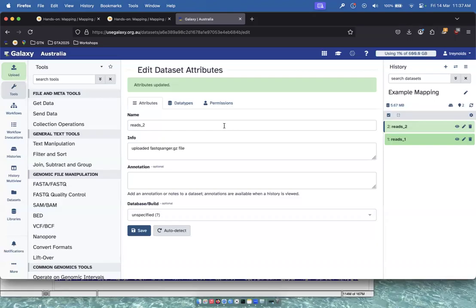For most model organisms, there are several possible reference genomes available. For human, for example, there can be the HG19 reference genome or the HG38. In our case, we are dealing with ChIP-seq data for mice, so we're going to use one of the mouse reference genomes. In particular, for this tutorial, we're going to use the MM10 reference.